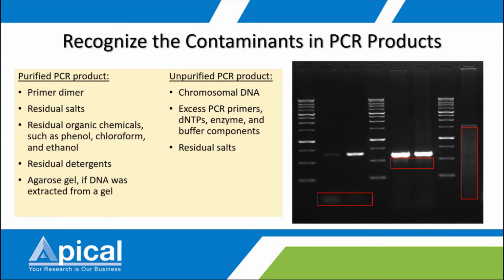All these may cause background noise in your sequencing. So this is what you want to get rid of before you can use your sample for sequencing.